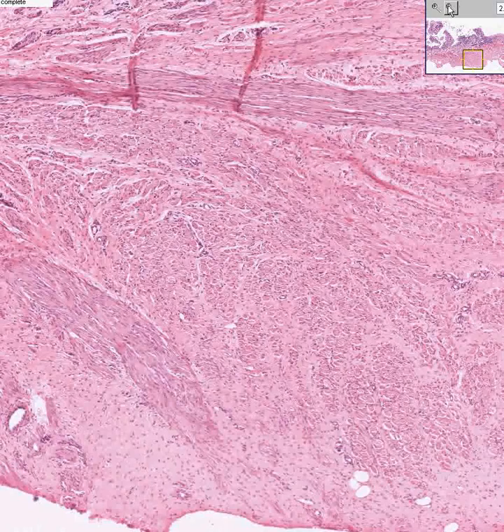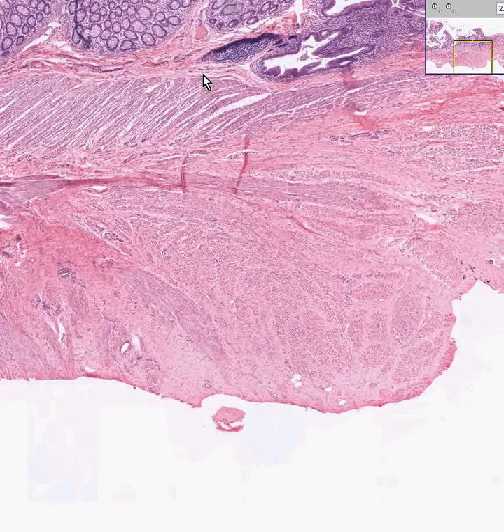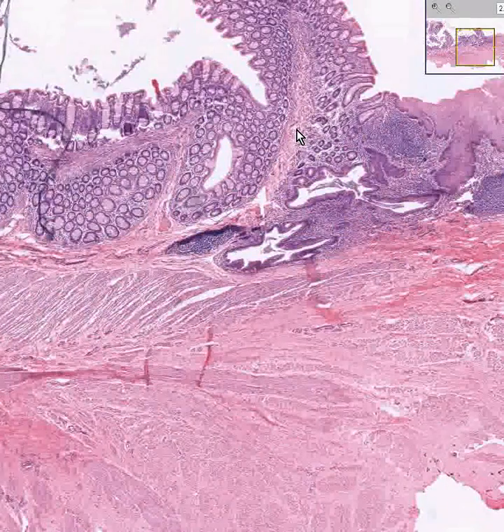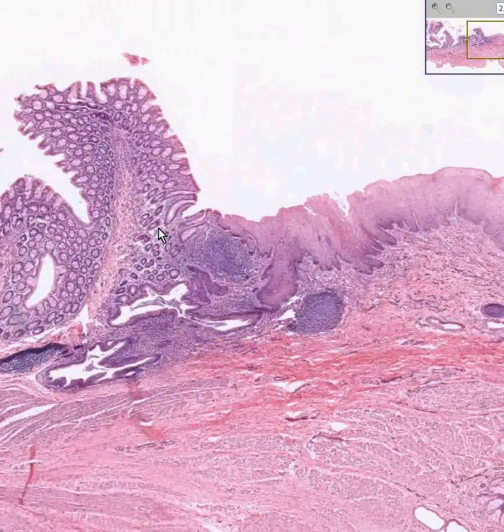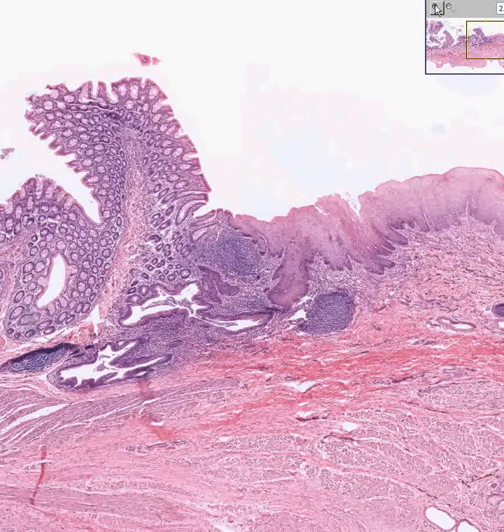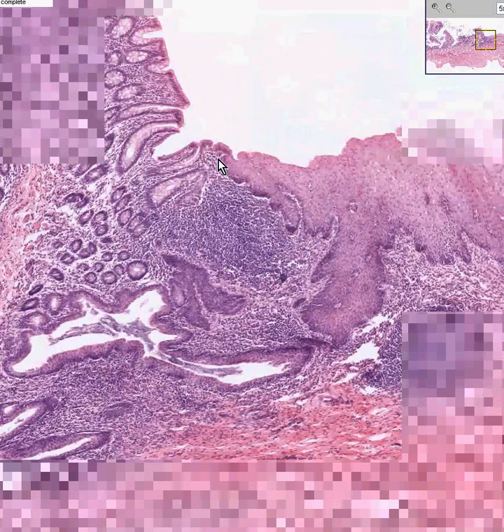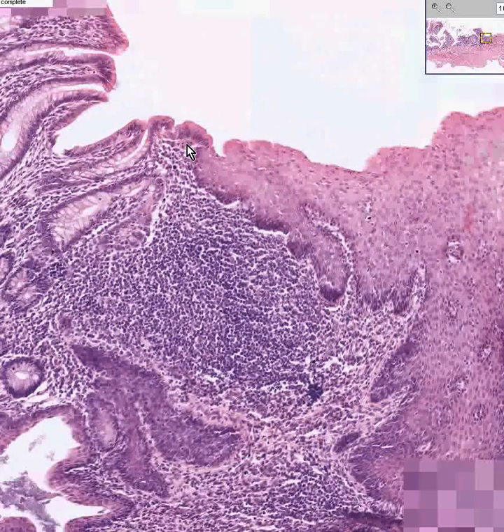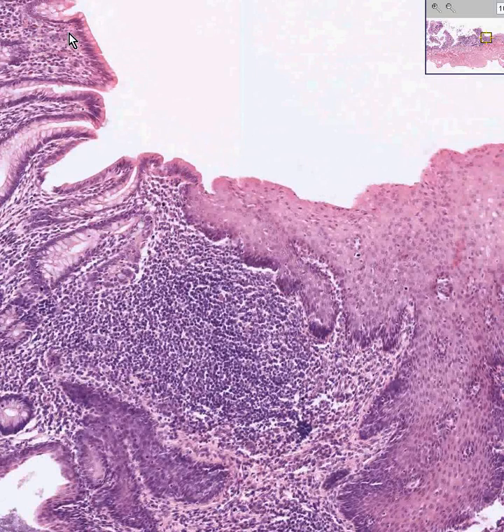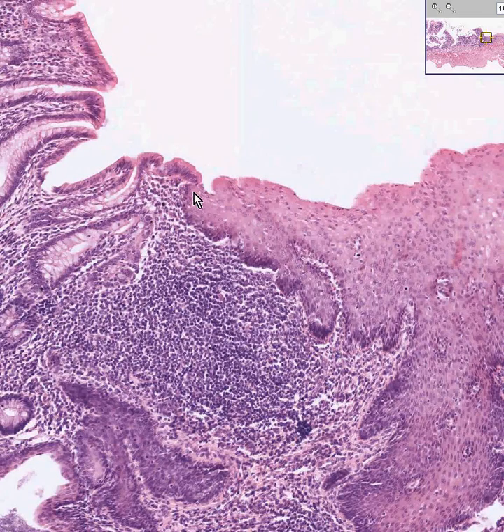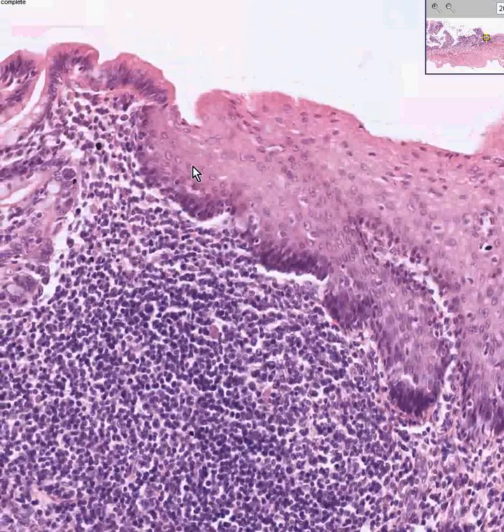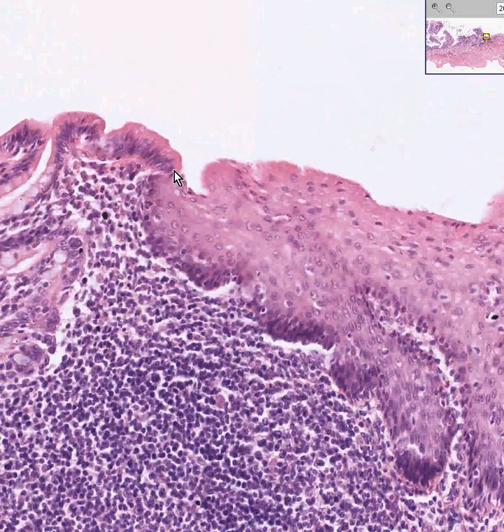This is the squamous-columnar junction of the rectum and anus. The precise location is also called the pectinate line. You could actually boil down the actual transition to a single cell — all of these are your columnar cells of the rectum and your squamous cells of the anus. Here is probably the last columnar cell and here is probably the first squamous cell right there.